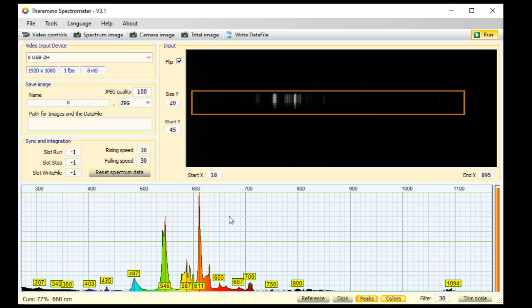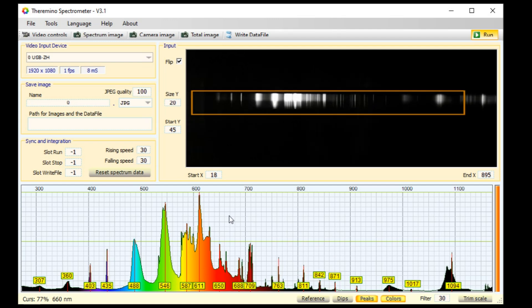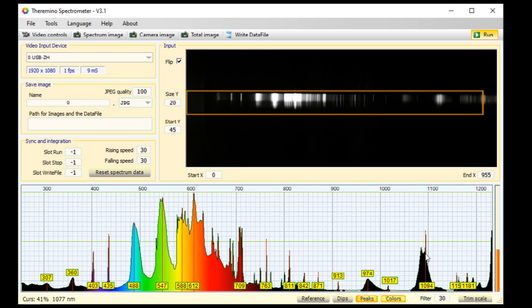If I point the camera more directly at the light bulb, I can see some lines way out in the infrared. I don't trust these, as they may be a secondary spectrum that is a repeat of the first. This double peak is suspiciously like the green double peak, and this strong peak is similar to the orange Europium peak. I think you can trust everything up to about a thousand nanometers.